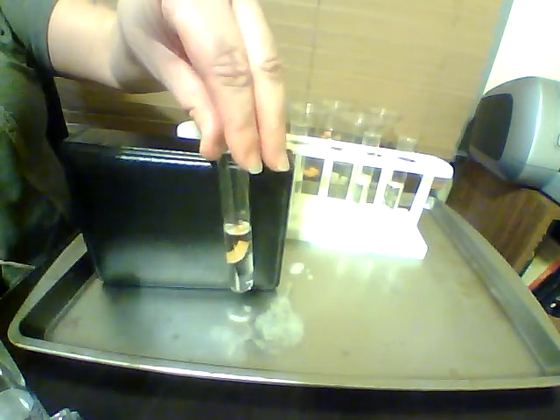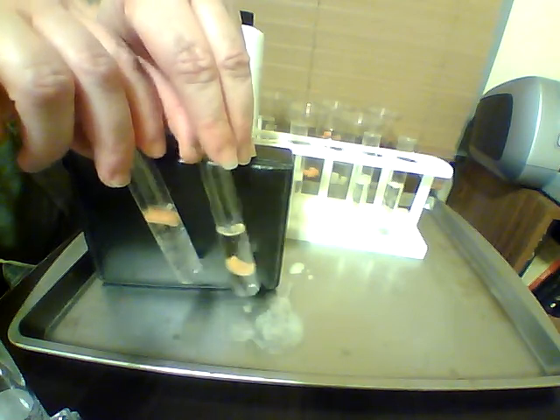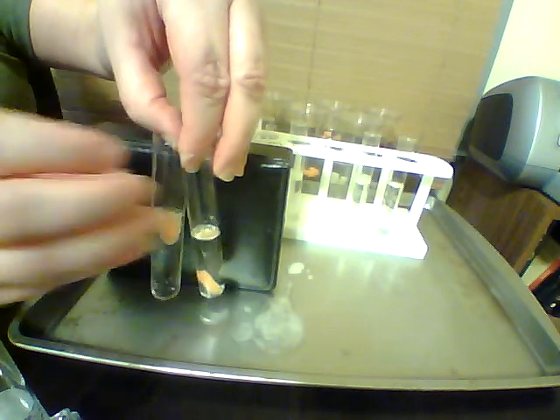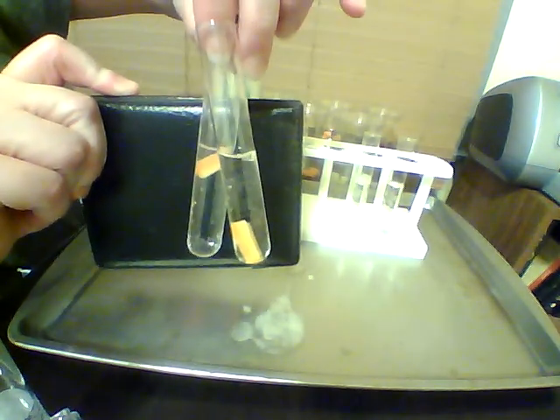All right, so we have our cooked carrot. We have our raw carrot. So you can see that the raw carrot, there's little bubbles. Kind of see the tube looks a little cloudy. That's actually little bubbles all over the sides of the tube. So you can see that there is much more reaction in our raw carrot than our cooked carrot. Still not a ton in either, right?